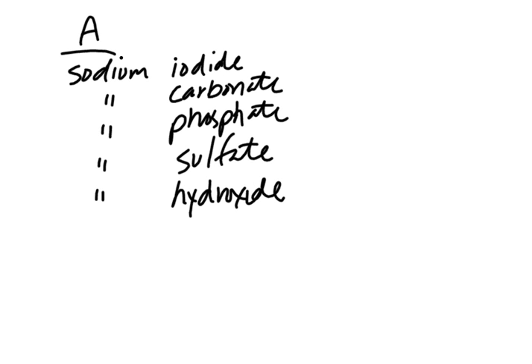Now, the concentration of these chemicals is going to be fairly low, just enough to see a reaction. But it's a wise policy to always treat anything in the lab as if it would hurt you, especially the sodium hydroxide right here, because that's what we consider a strong base and can be very detrimental to us. So we're going to be goggled up. You're going to have aprons on if you choose. But this is your collection of chemicals for A.